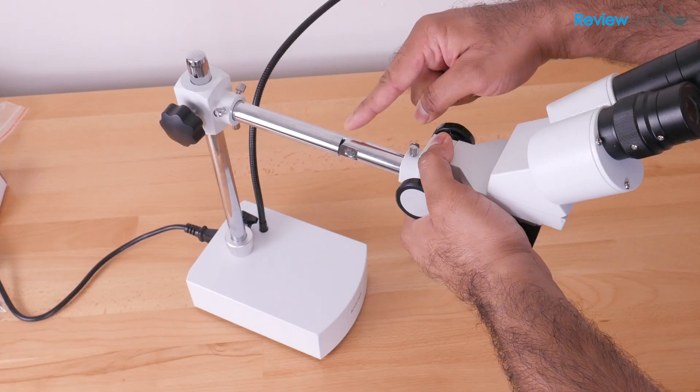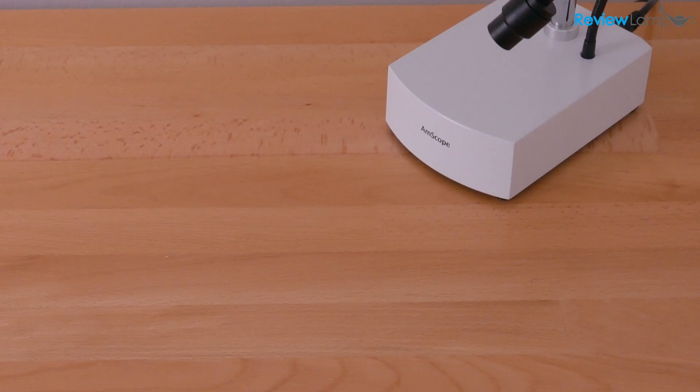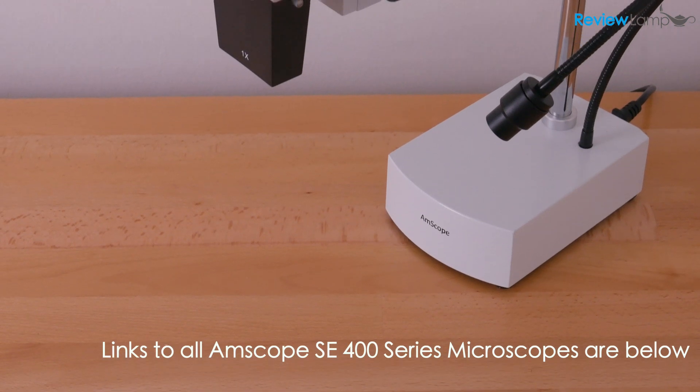In today's video, we're going to be unboxing and assembling an Amscope SE400 series microscope.